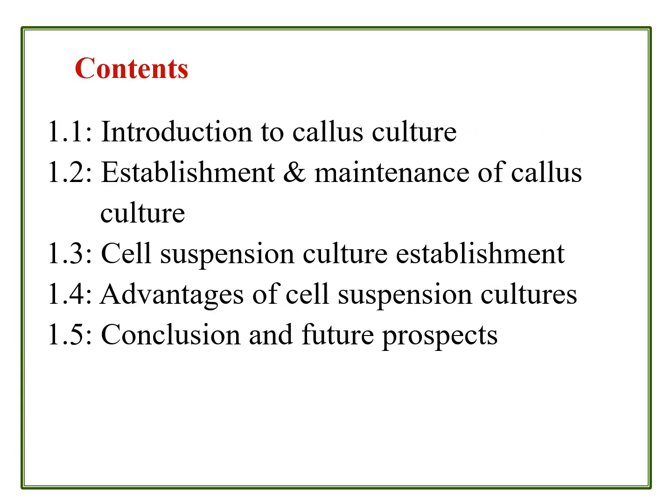Let us see the contents in this chapter. First of all, introduction to the callus culture. What is the callus culture? How can callus culture be established? And what are the requirements for the callus culture? Culture material: what type of culture material should be used? And culture material characteristics will be discussed in the first concept.